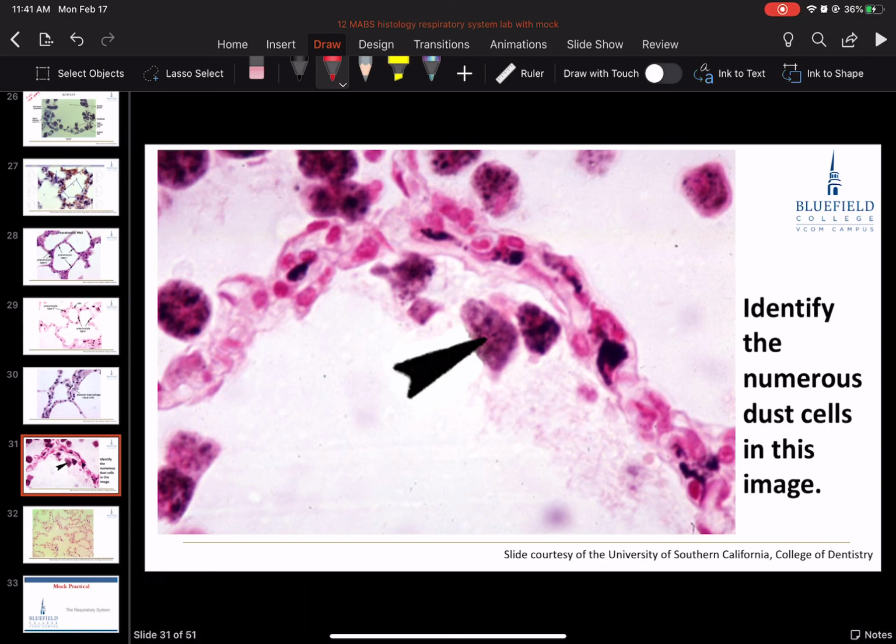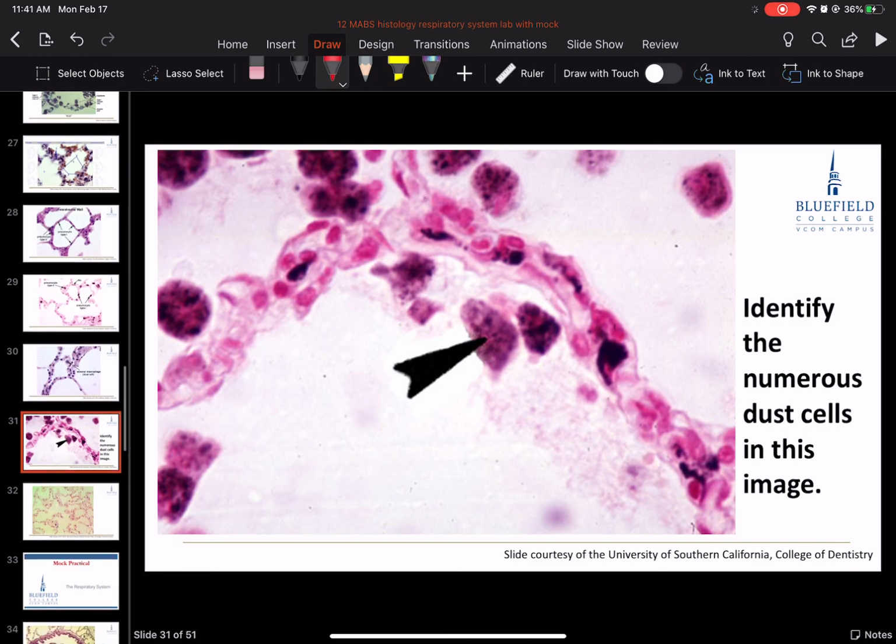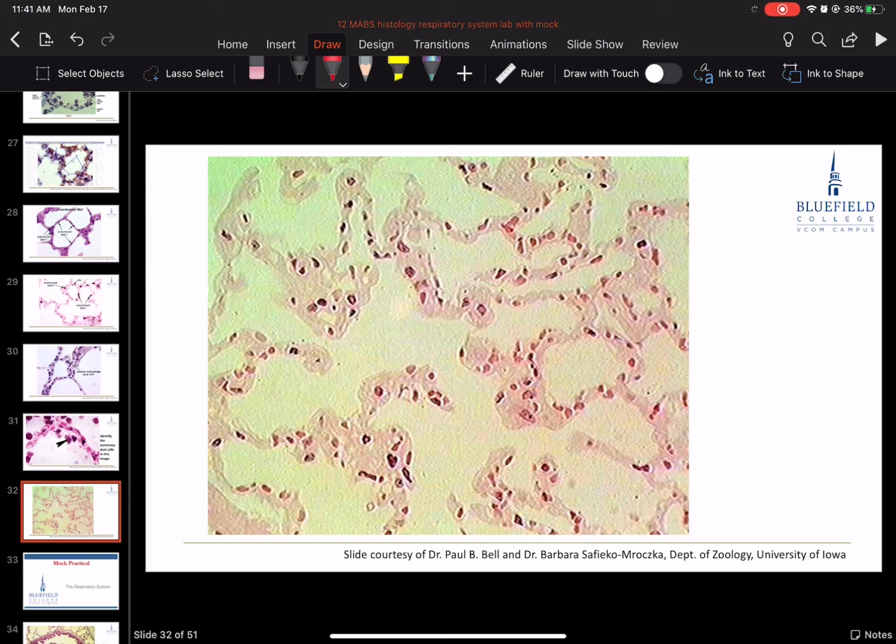All right, here is one, let's say from a 5-year-old, because it's not nearly as thin. Lower power magnification, if I'm going to label it, I'm going to label this nucleus right here that I'm circling as a type 1, I'm sorry, type 2. Okay, see how the cytoplasm bulges out into the lumen over here a little bit? If I was going to label a type 1, I'd probably pick this nucleus to the right of the pointer. Here's even a better one right here to the right of the pointer. Okay, plenty to choose from. I'll typically go through here and pick out very, very good ones, if I'm going to label it for an exam. All right, that is what we've got.